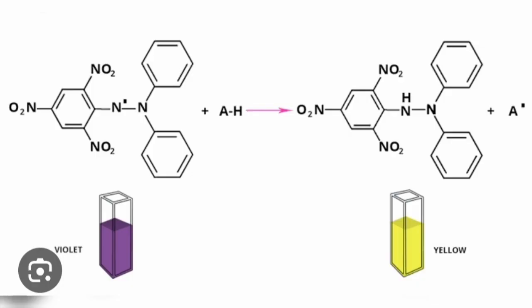Okay, so we were talking about the mechanism of DPPH, so let's get back to it. So the original color of DPPH is deep violet, when it is in the free radical form. So what happens is that when it reacts with the antioxidant, it is reduced by the antioxidant. That is, when it gets an electron from the antioxidant and its lonely electron gets paired, it changes color.